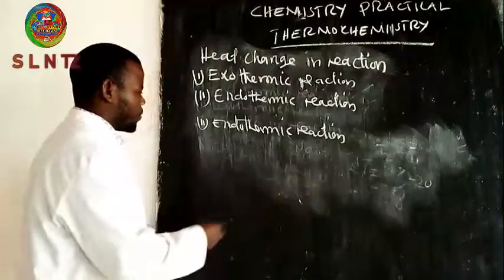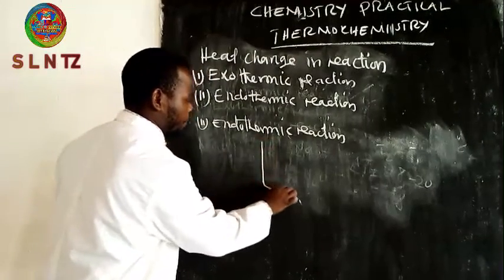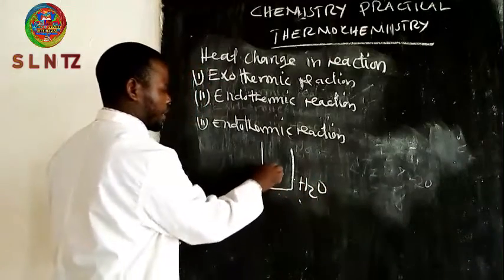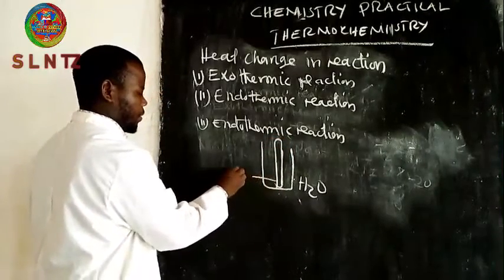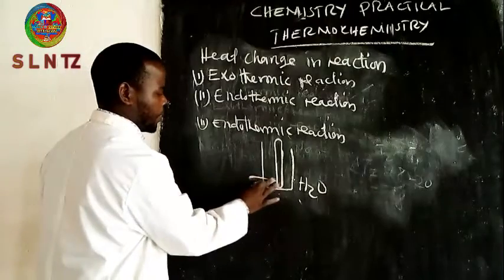Let's say this is your beaker, this is water, and this is the thermometer.